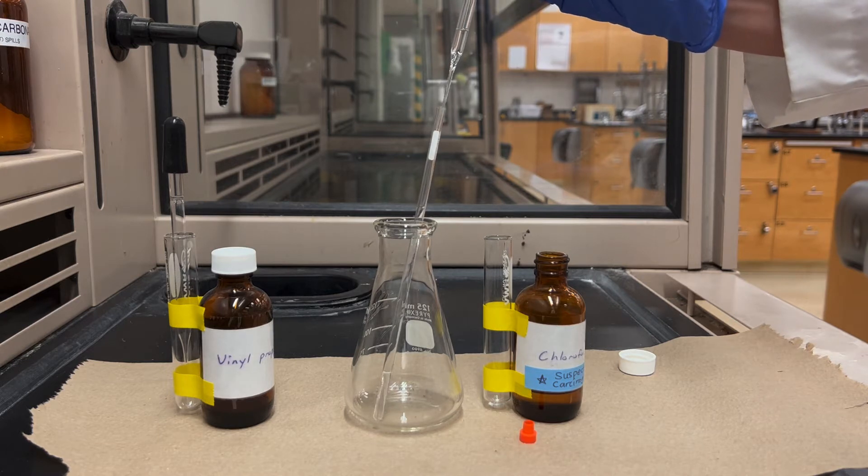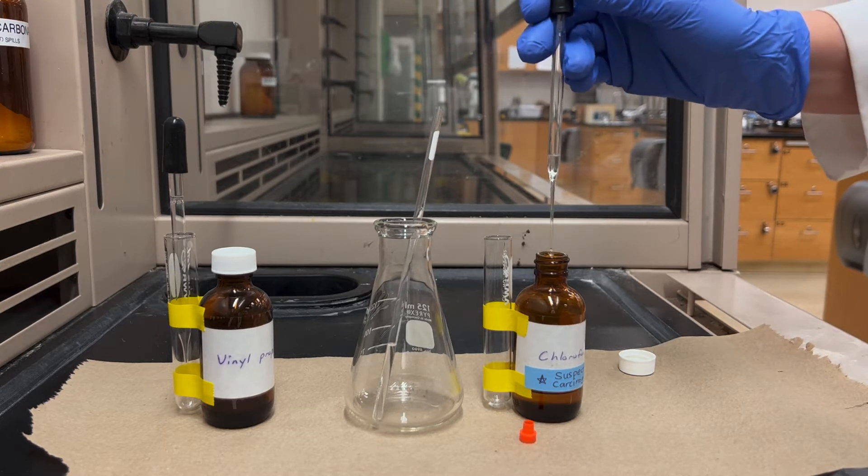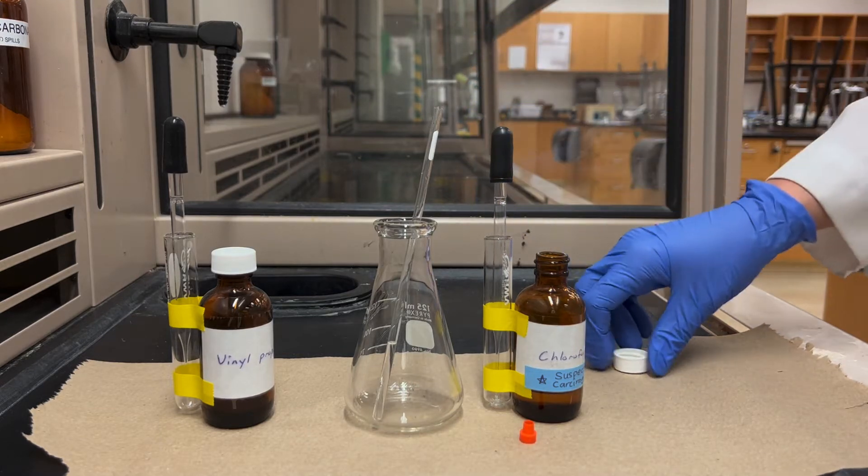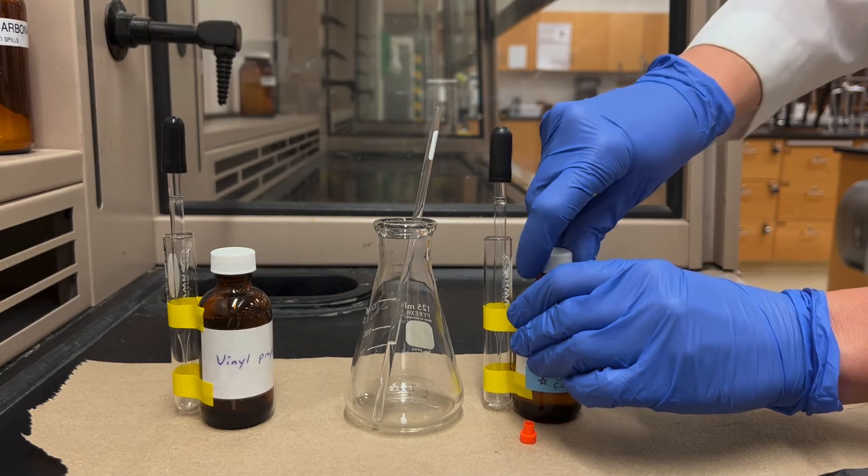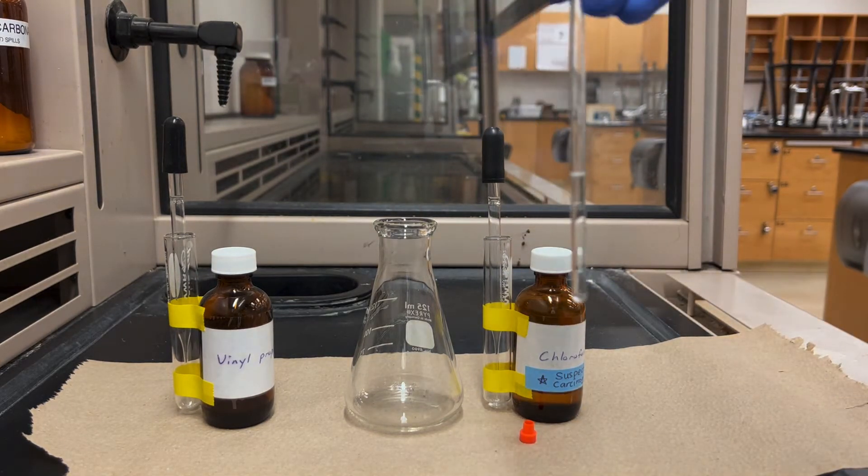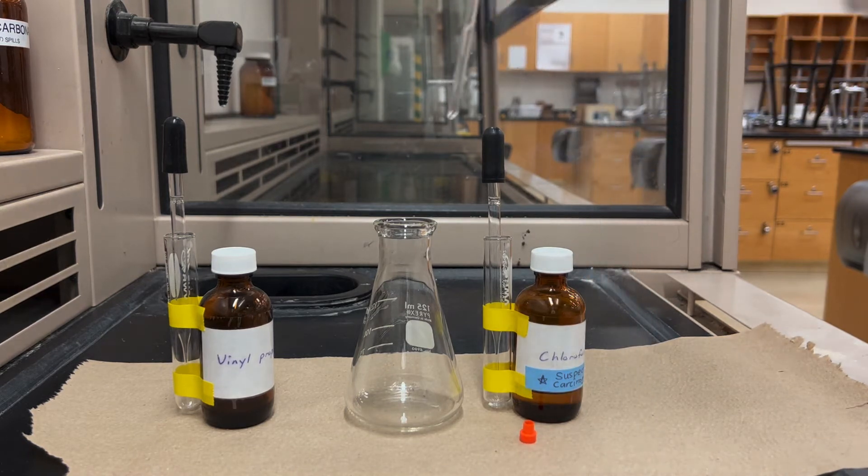Then you can add that to your NMR tube and you want to fill it up to about one and a half inches high. If you have extra you can actually put that back into the reagent jar, especially if you know that that pipette is clean you won't necessarily cross contaminate it, and deuterochloroform is actually quite expensive so we don't want to waste it.